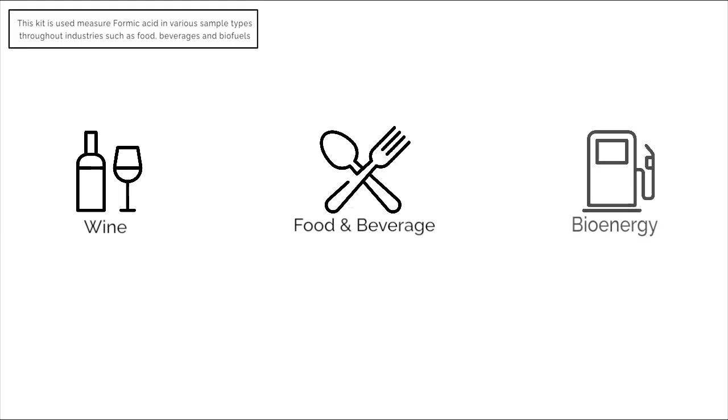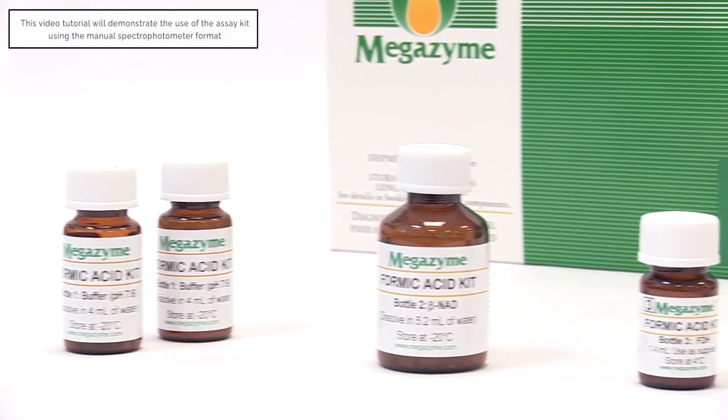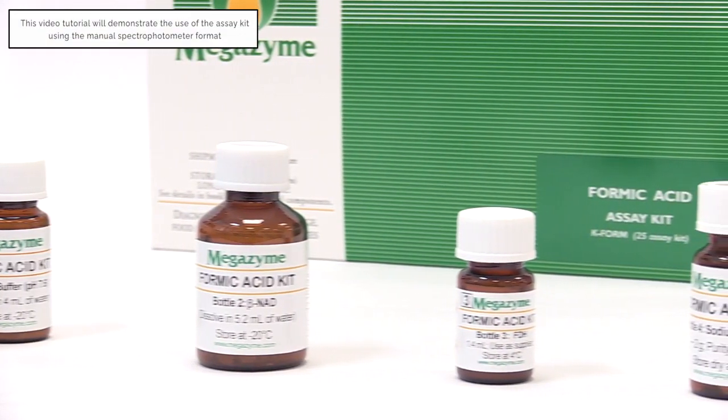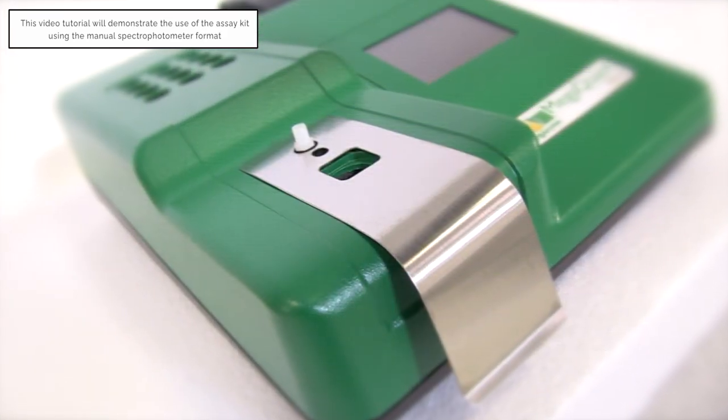Formic acid in foods, beverages and other materials. This video tutorial will demonstrate the use of the kit with a wine sample using the manual spectrophotometer format.